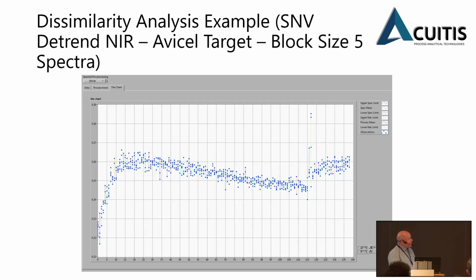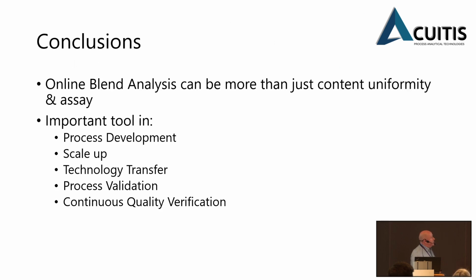So one of the approaches that we used to use a long time ago was this representation, which I think is nice, using that moving block approach, where you can see the actual change in homogeneity coming in. Again, it's an incomplete blend from one of these cases, but it's a good indication of overall content uniformity, a way of visualizing it as well.